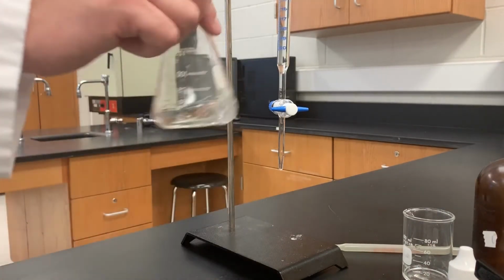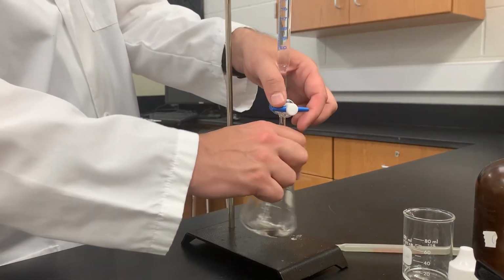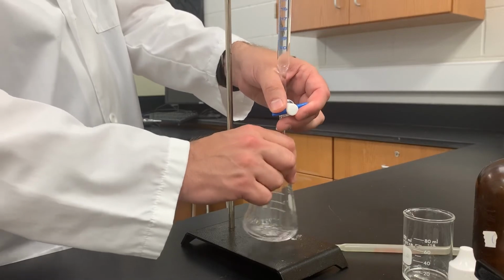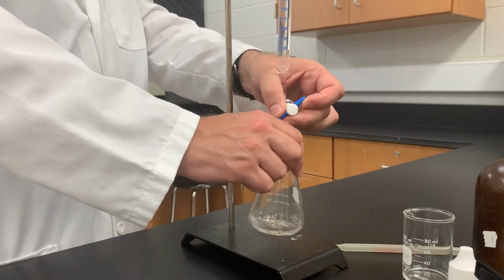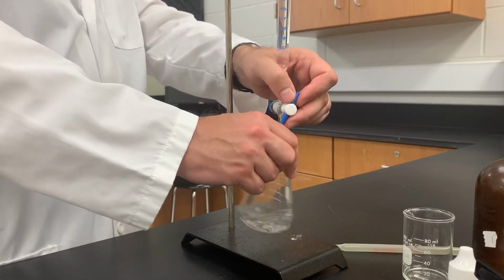Now to use this burette, I'm going to hold the flask with my right hand and swirl while I add the base and manipulate the stopcock with my left hand. Whichever hand you're right with is typically the one you're going to want to use for the swirling action.